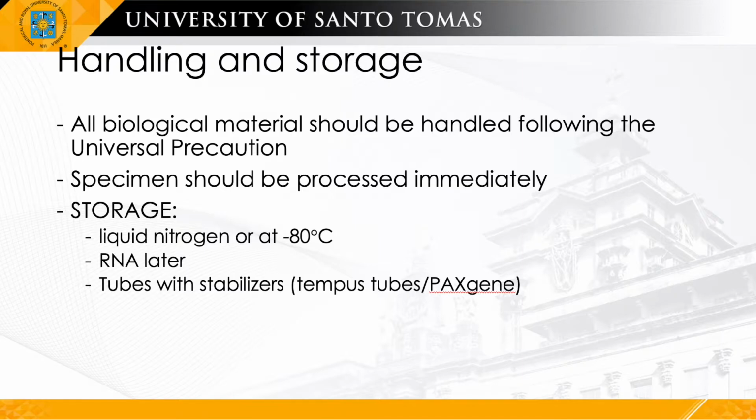Another important storage technique is RNA tubes with stabilizer, or what you call PAXgene or Tempus tubes. The PAXgene Blood RNA System is a marketed product for the collection, storage, and transportation of blood and stabilization of intracellular RNA in a closed tube, with subsequent isolation and purification of intracellular RNA from whole blood for RT-PCR used in the molecular diagnostic setting.